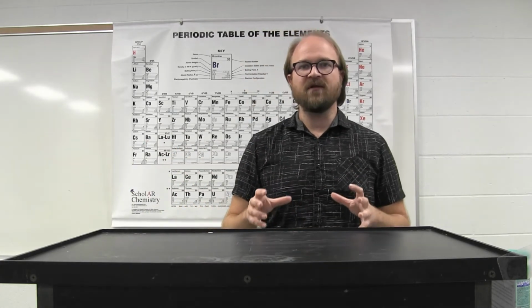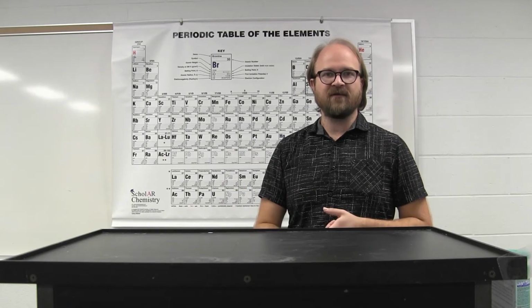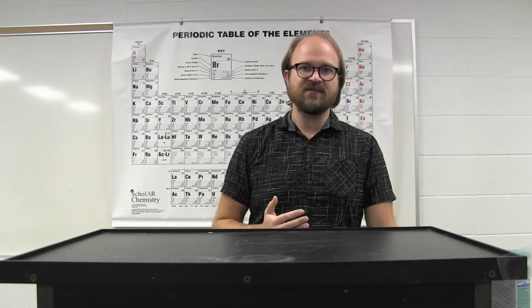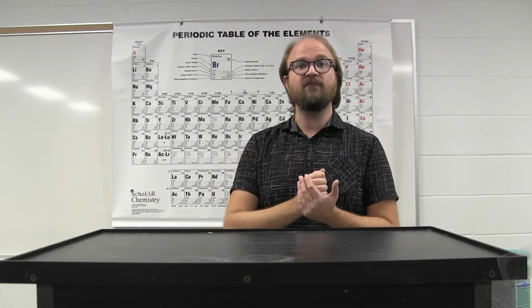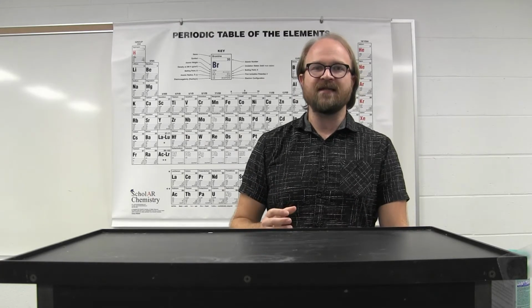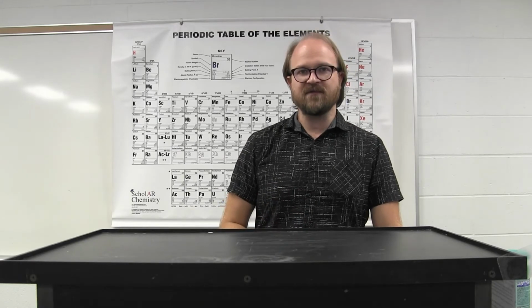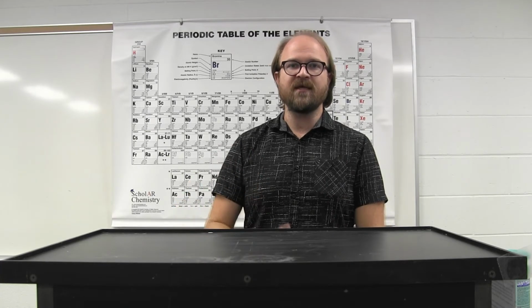And this experiment looks at how to determine the limiting reactant, both in theoretical ways, with calculations to determine the limiting reactant based on the sheer number of moles that are available in a situation. And the experiment itself also looks at determining the limiting reactant based on experimental observations, looking to see, based on experiments, what is the limiting reactant.